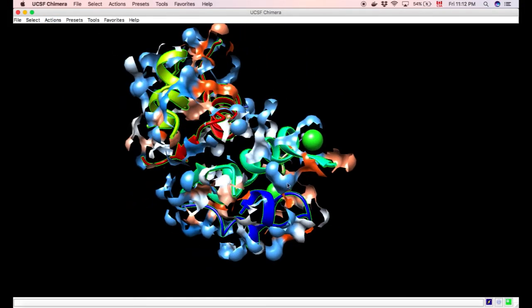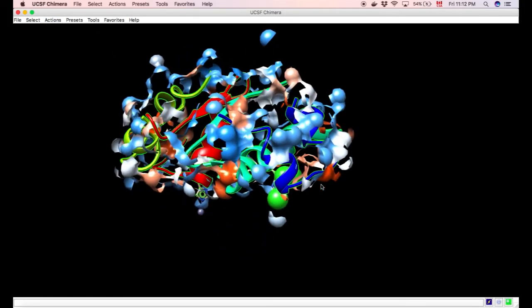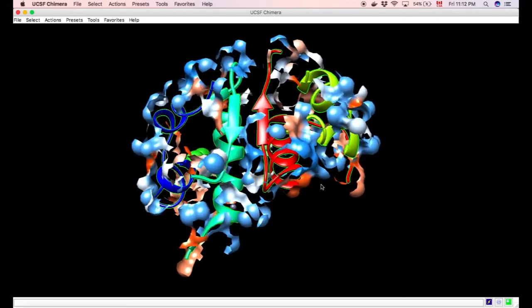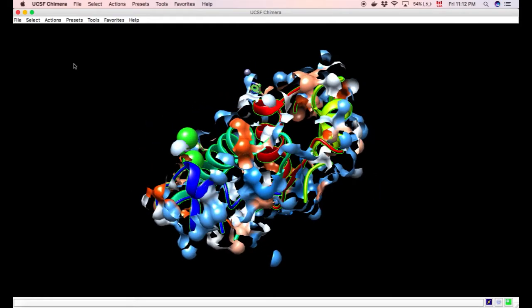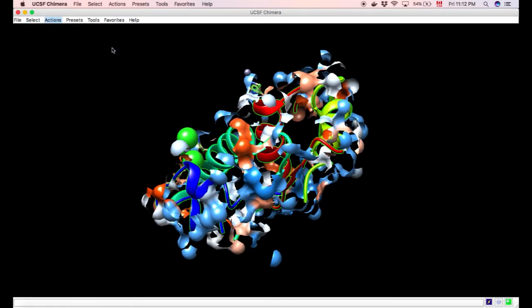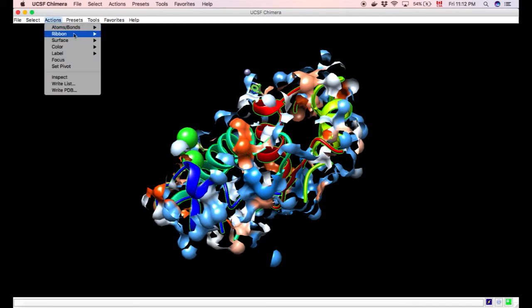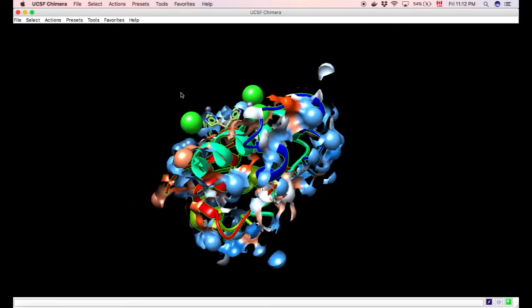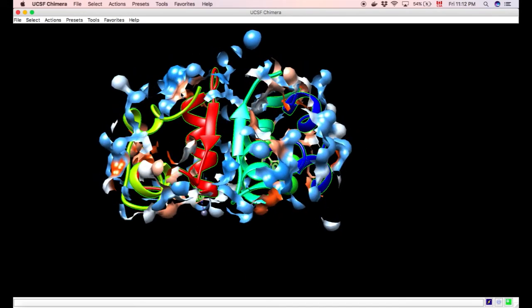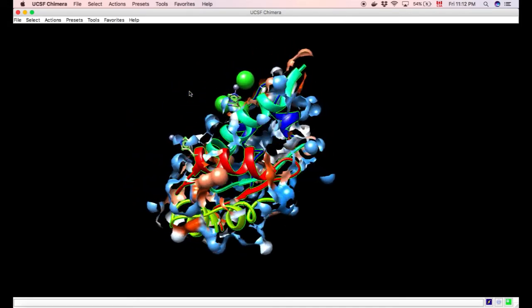Okay, I understand. So Chimera created two partial objects here, for some reason, but you can understand that, first of all, calculating surfaces can be quite computationally intensive. Actually, when you have a really, really big structure, it can crash your Chimera session.